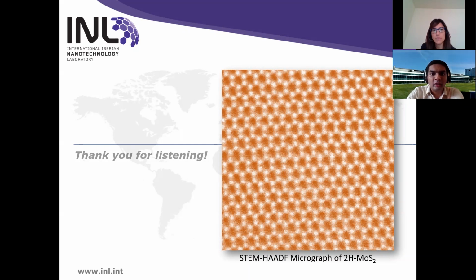How do you see the use of dual beam to study soft materials such as proteins or carbohydrate-based structures? From Miguel Cerqueira.